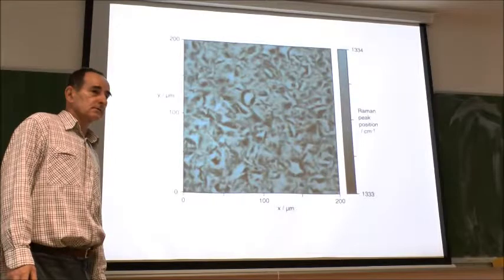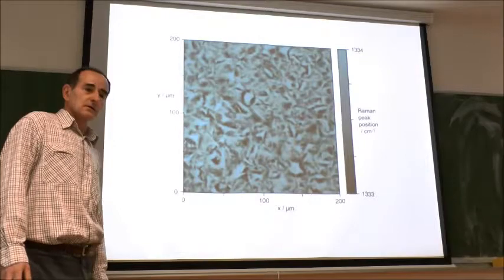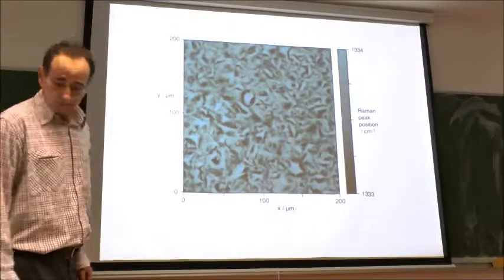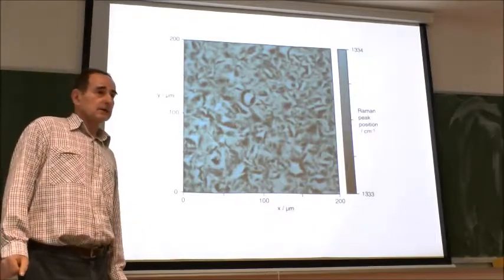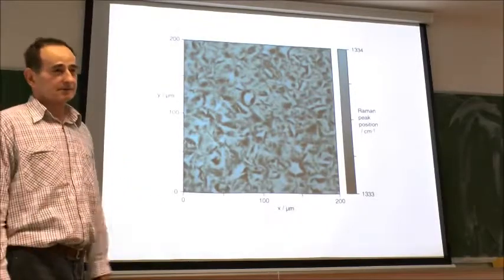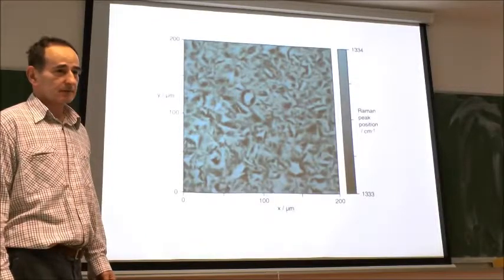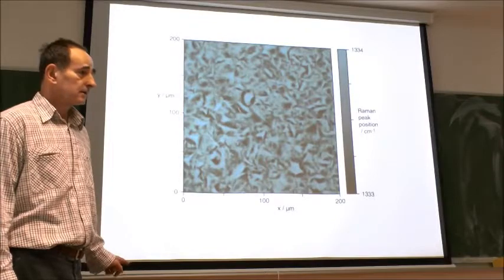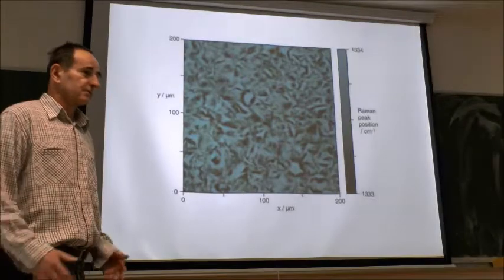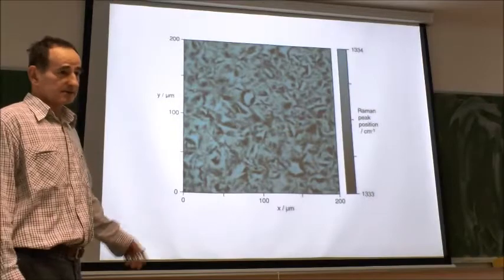You said that you measure 180 degree backscattering. Yes. How about solids? I mean, not transfer. So backscattering is measured in the back direction. There are no other options like 90 degrees here. Of course, there is an option, but you have to work on it yourself. At present, it's not available.